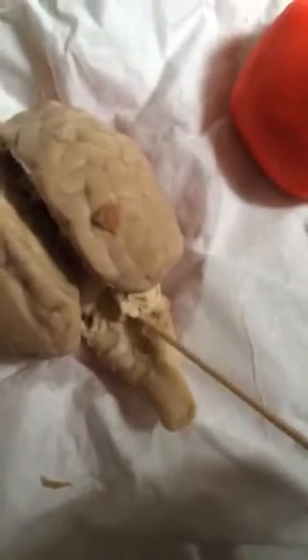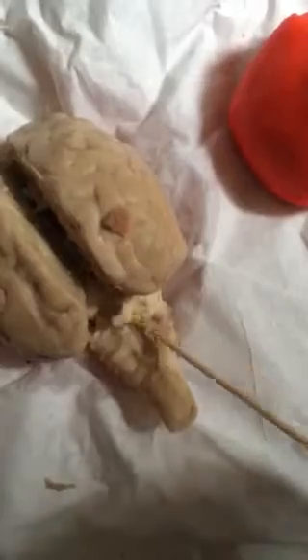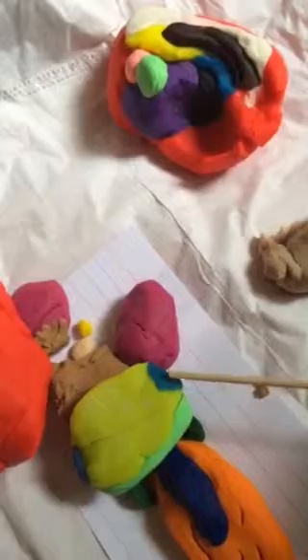And I believe I actually tore the ventricle. It's somewhere underneath this flap in the sheep's brain. This is the medulla. This area right here is the middle peduncle, and the inferior peduncle is right here.